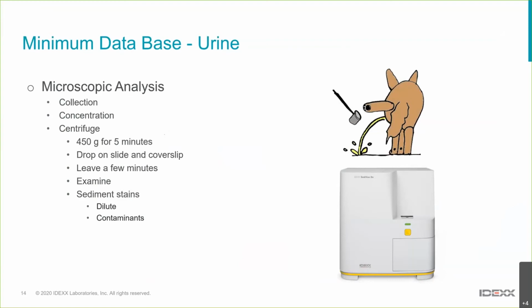The other challenge we sometimes have when looking at the sediment is finding bacteria. It's important. We obviously want to look for bacteria on the wet preparation, so rods can be a little clearer. If you're seeing rods there, they likely truly have an infection.